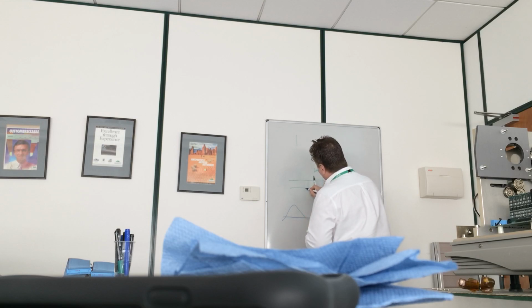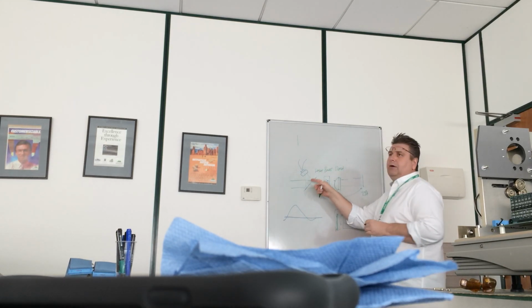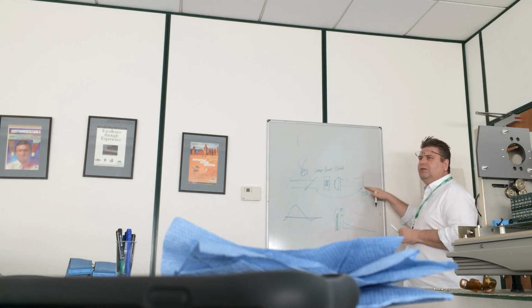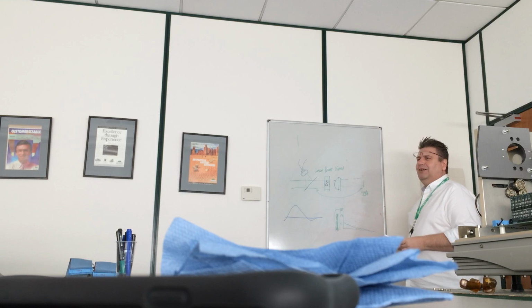So the only way to do this is if we sample the laser light here, so some of this laser light gets reflected into what's called the laser monitor. We know the laser power to begin with, right here. We know what it's going to finish like back here because we're looking at channel 0. We can work out what the background loss is between the two. Fantastic.